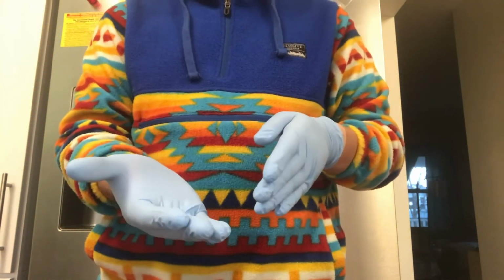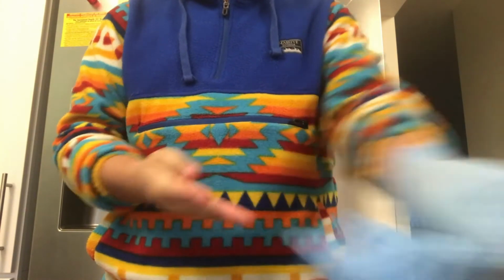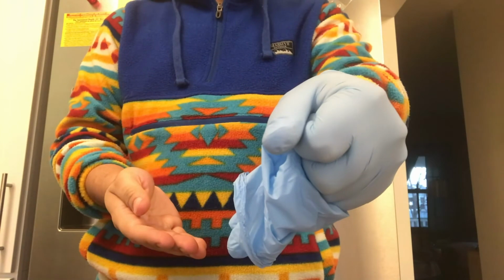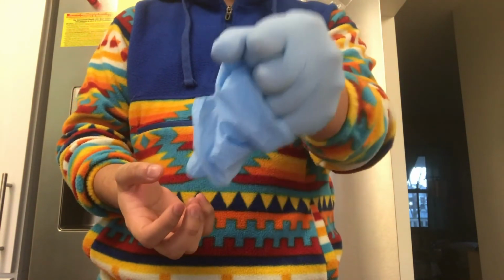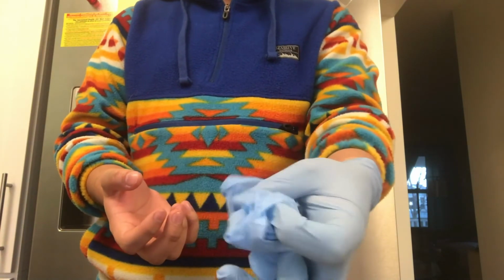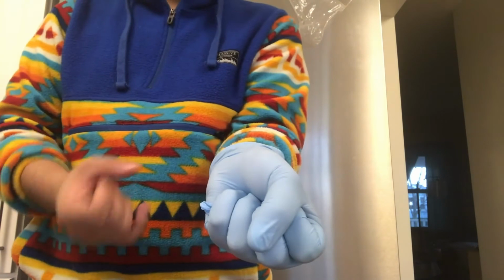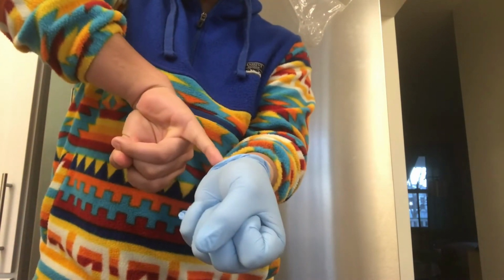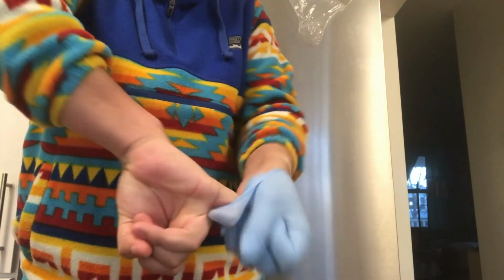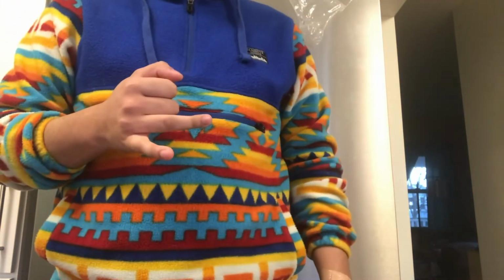You're going to turn your one hand over, you're going to grab the inside of your palm with your one glove, and you're going to pull it straight forward, just like that. And notice how I didn't even touch any other part of my hand with my dirty glove, I just pulled it right off. Now you're going to form it into a ball in your fist, just like that. You're going to take your pinky, simply grab at the end of your wrist, pull it forward, and when you're done, toss it in the trash can.